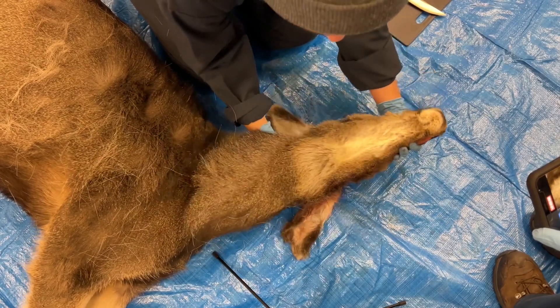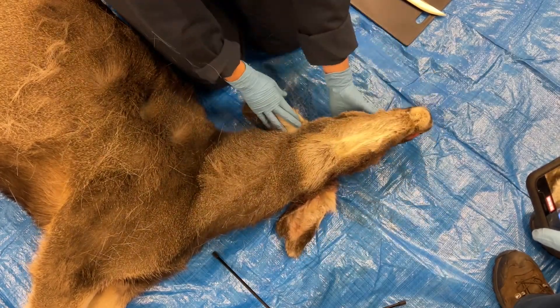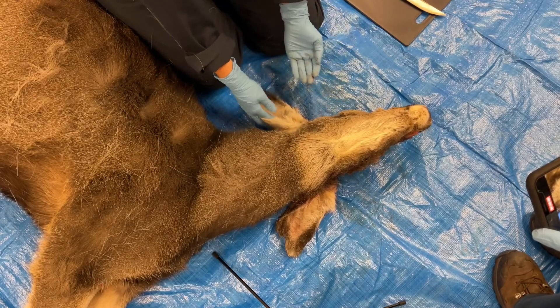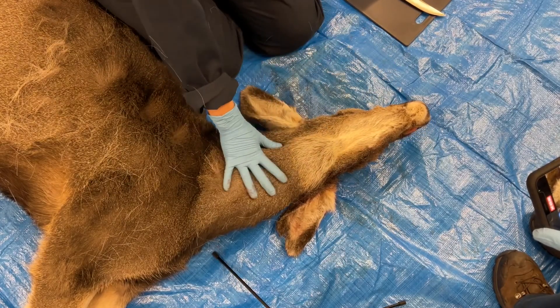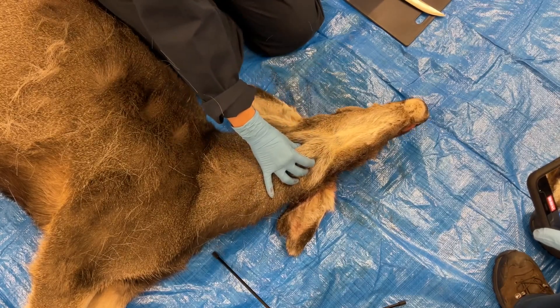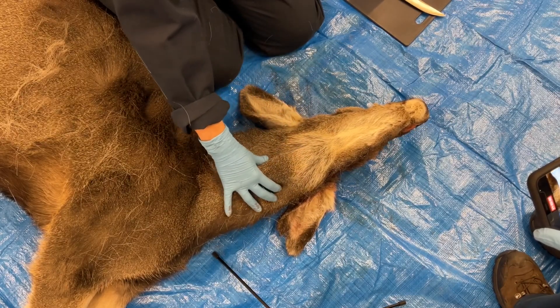This is a demonstration on how to properly remove the head and tissues for chronic wasting disease testing. The samples used for testing are located at the back of the throat and are called the retropharyngeal lymph nodes and the tonsils.